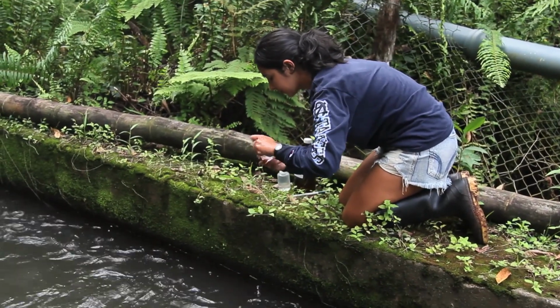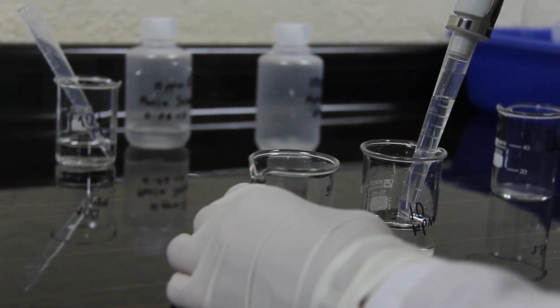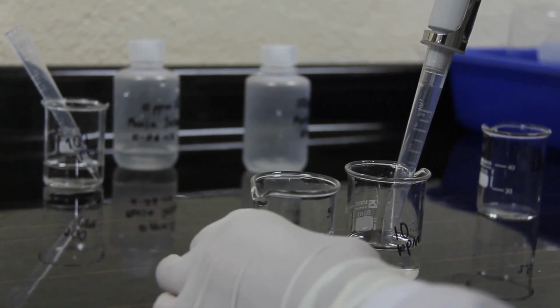And we're also doing physical and chemical tests just to see how the water quality is. Some of those physical tests include chlorides, sulfates, residuals.